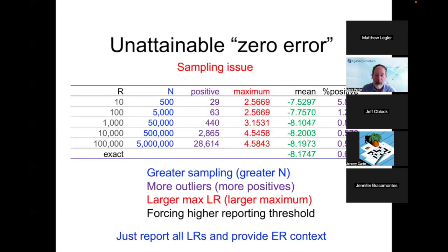And this is what we calculated. See, what is the whole purpose of a reporting threshold? As has been explained to me by about 6 different DNA tech leads, the point of it is that if in your validation, you don't see any adventitious hits, then you have confidence that when you set your reporting threshold over the level where you might have seen adventitious hits, you're not going to see any, and your error rate from your validation for adventitious hits is 0.